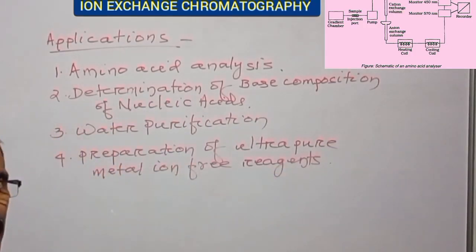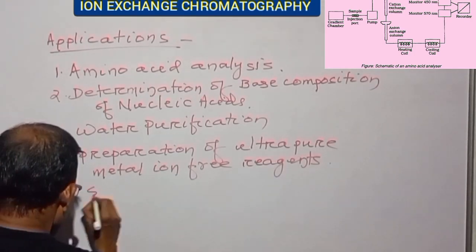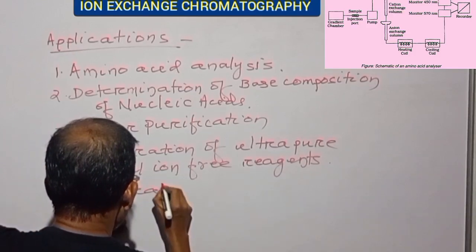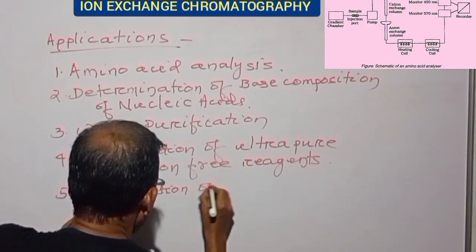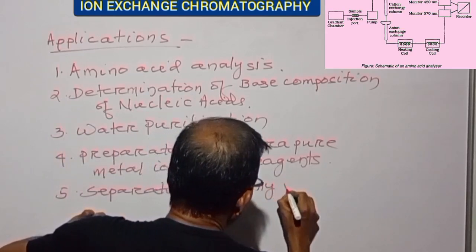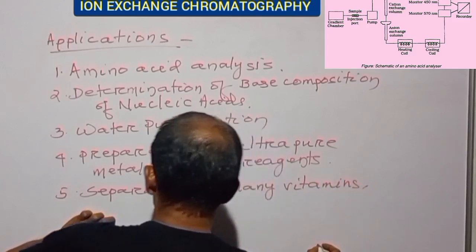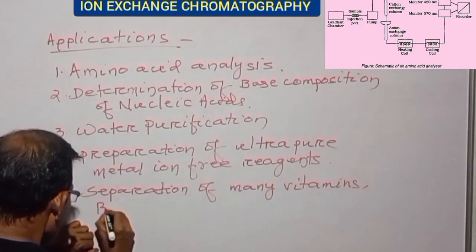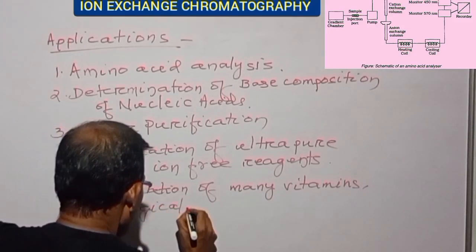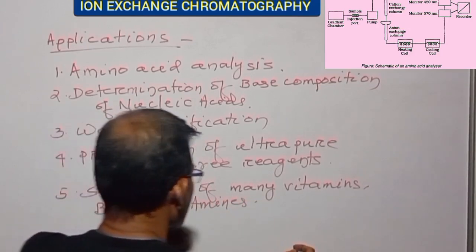Apart from this, ion exchange chromatography is also useful in the separation of many vitamins, biological amines, organic acids and bases.